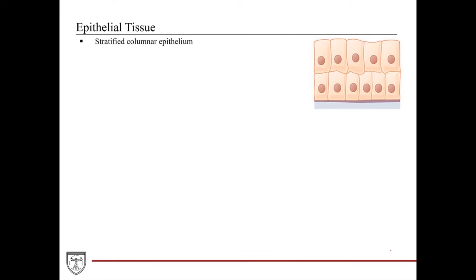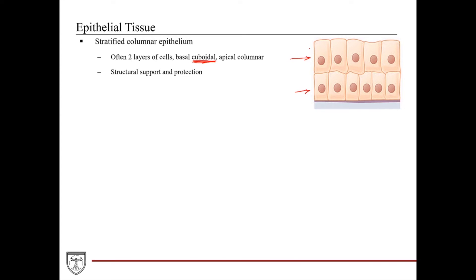Another stratified epithelium that is not quite as common is the stratified columnar epithelium. This tissue is also comprised of typically just two layers of cells. Despite how it may look in diagrams, the basal compartment cells tend to be more cuboidal in shape — short and rounded — and it's really the apical surface cells that are the true columnar cells. Such an epithelium is typically associated with larger ducts where it provides structural support and protection, and it is also found lining the conjunctiva — the mucous lining of the whites of our eyes as well as the inside of our eyelids.